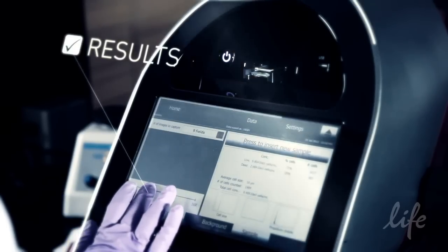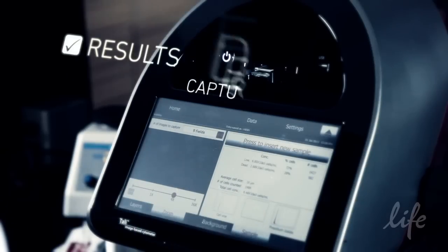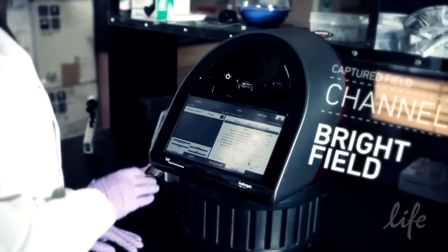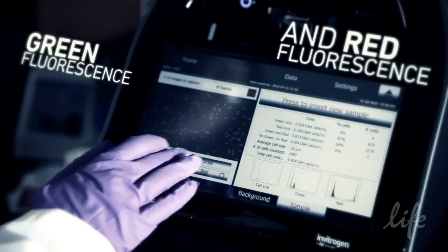This is where TALI really shines. Each captured field of view can be reviewed in every channel: bright field, green fluorescence and red fluorescence to confirm accuracy.